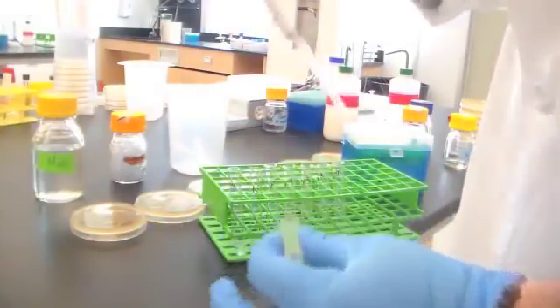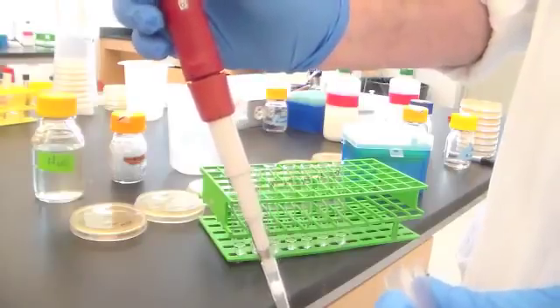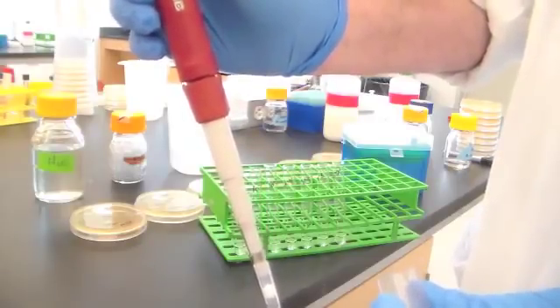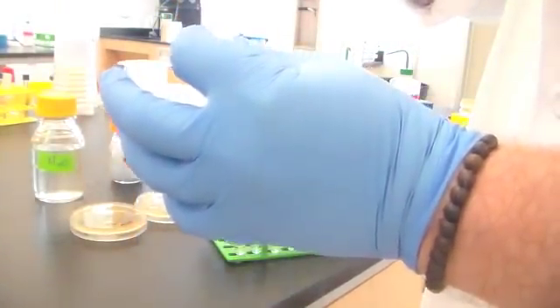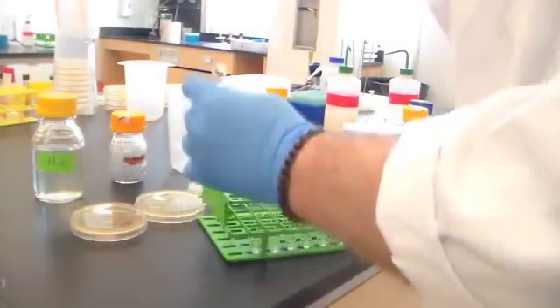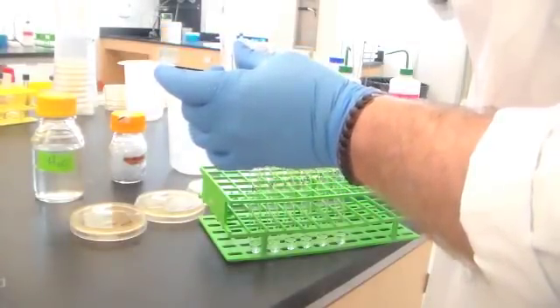So what I'm going to do is I've now set the pipette to 1/10 of 1 mil, or 100 microliters. So I'm going to go down again, first stop, I'm going into that cuvette, I'm pulling up now 100 microliters, and I'm going to put that 100 microliters into this first tube.